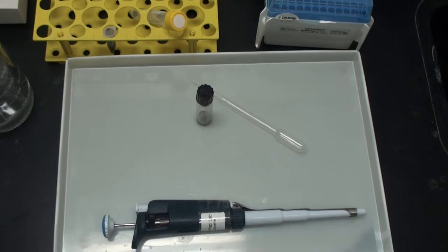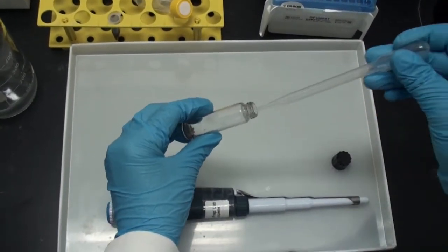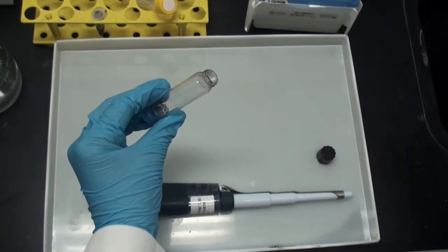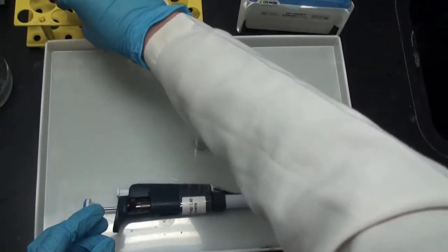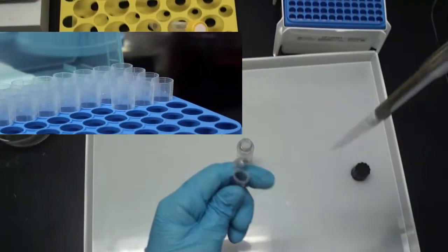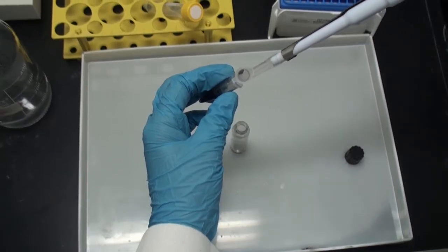Now we will remove and discard the glutaraldehyde after two days of fixation. We will then put osmium tetroxide as a post-fixative material. Remember that osmium is toxic, so this has to be done within the fume hood.